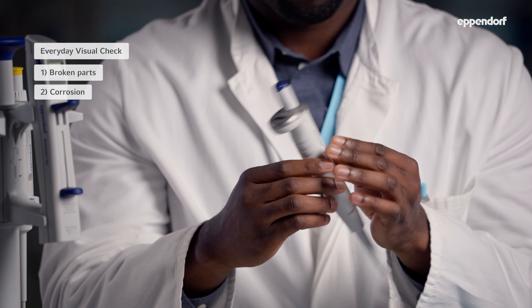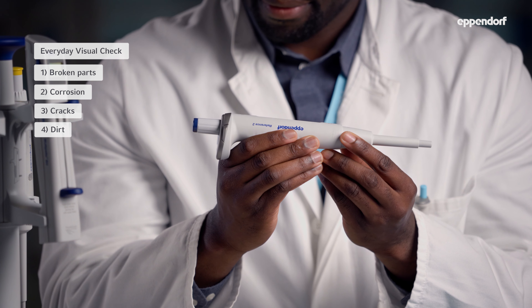But there are also some things you can do in the lab to make sure you enjoy an optimal pipetting experience. First, the visual check. Every day you should look closely at your pipet to check for any broken parts, visible corrosion, cracks or dirty spots. This one looks good.